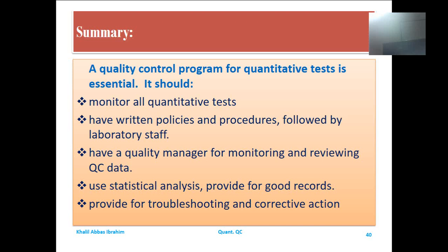You need to develop the policies, and after that develop and establish standard procedures out of that policy, and then create other steps to fulfill the system and the program of quality control. These policies and procedures should be followed by laboratory staff exactly and closely, and no one is allowed to bypass or ignore them or to work without adopting and obeying the policies and applying the procedures which have been adopted and endorsed.